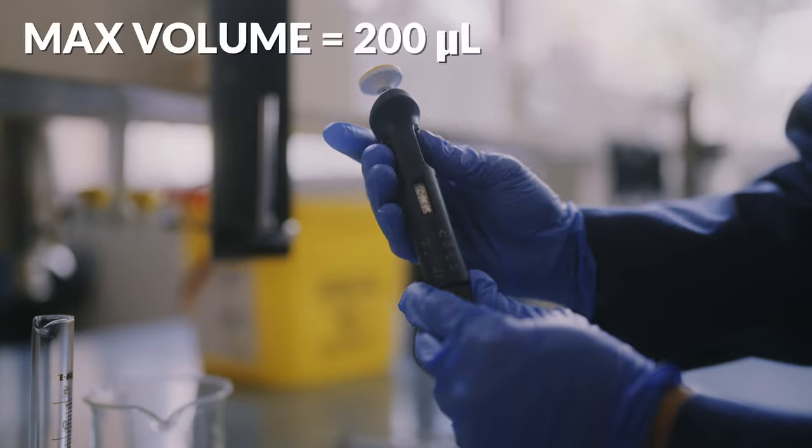Always know the upper limit of the pipette you're working with. When you try to go outside this range, not only will this damage the pipette, it will also affect its accuracy. We're not working with big volumes here, so even a small miscalibration can lead to dramatic differences in volume and concentration.